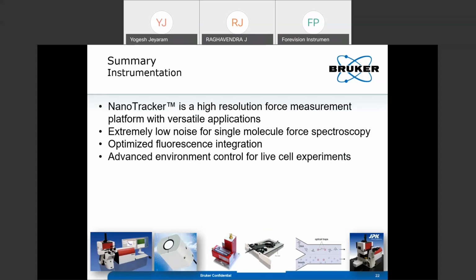I didn't show anything, so here you have a slide. You have these petri dish holders with built-in heaters, and also, for example, CO2 and humidity controllers attached. So you can control the living environment of your cells to a great degree, so you can do very, very long live-cell experiments, where the cells are happy and healthy, and you are performing your experiments over a long period of time.